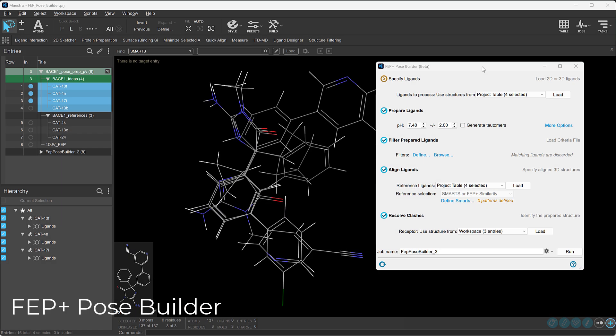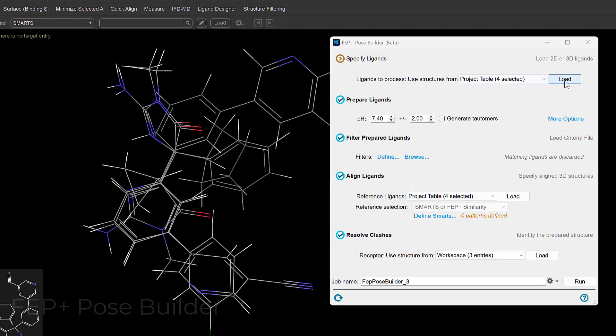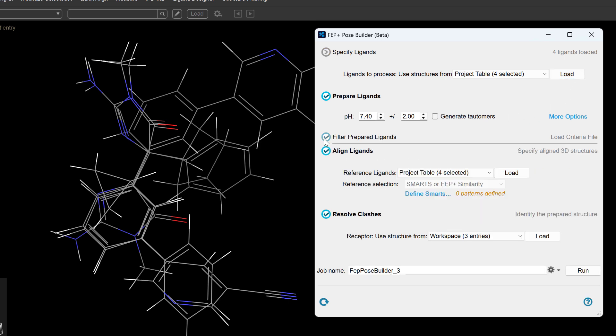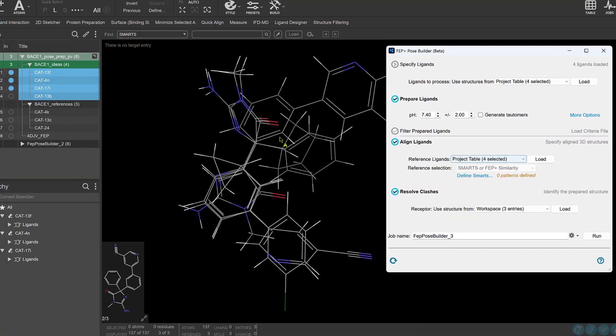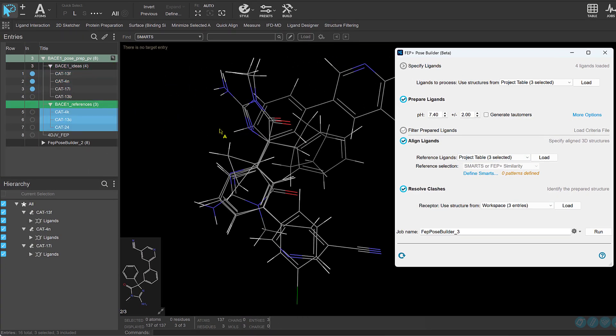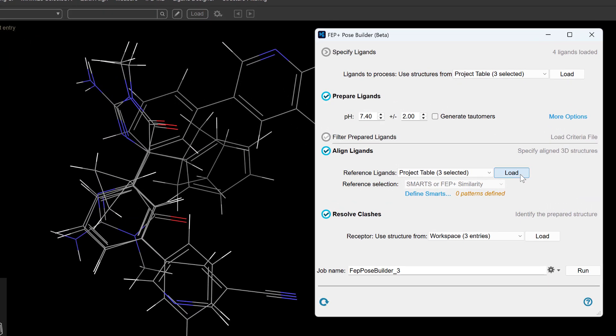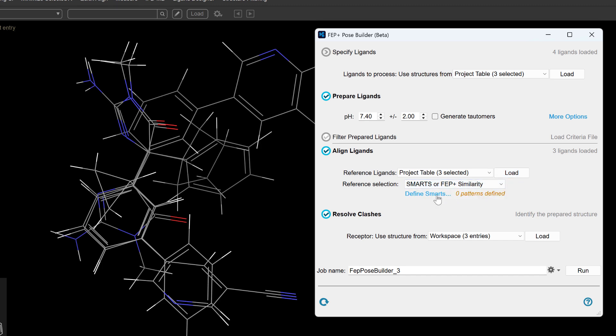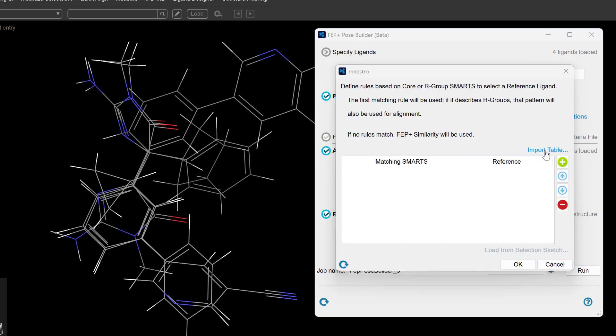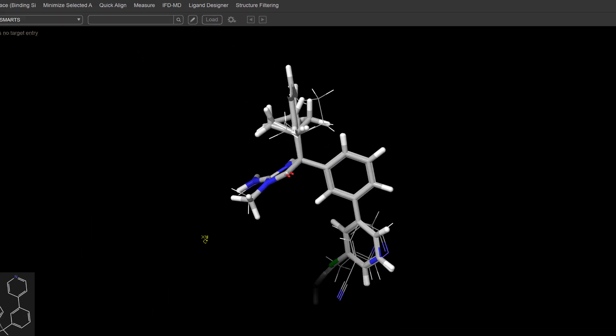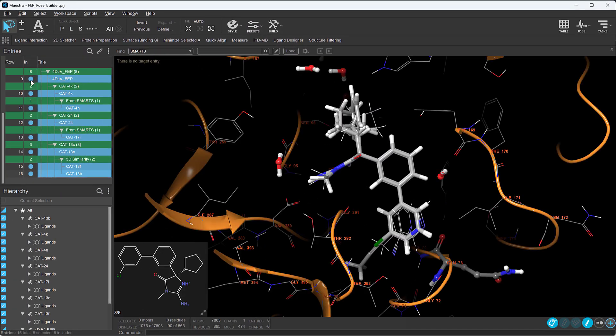Moving to FEP+, we're introducing the Pose Builder Workflow, currently in open beta, to automate the creation of high-quality ligand alignments. You can prepare reliable FEP-ready poses more quickly with its unbiased selection process and robust atom mapping, enabling efficient large-scale studies.